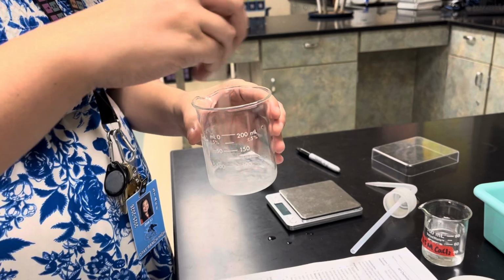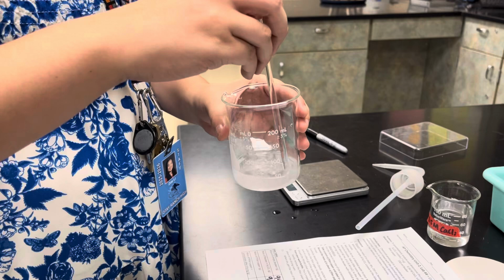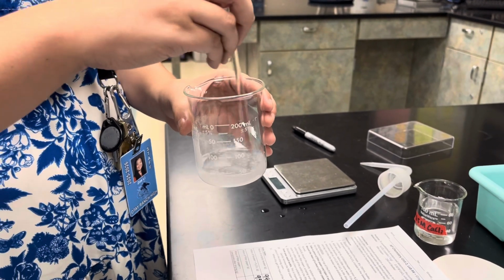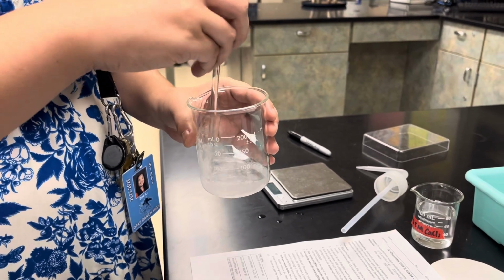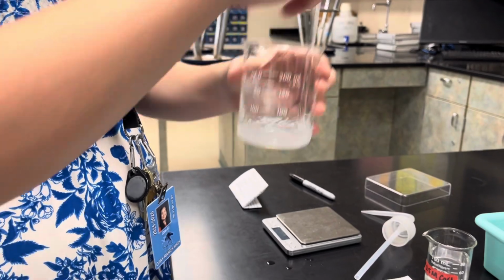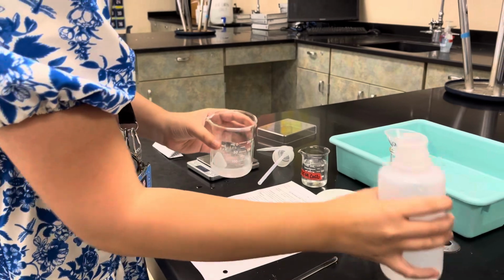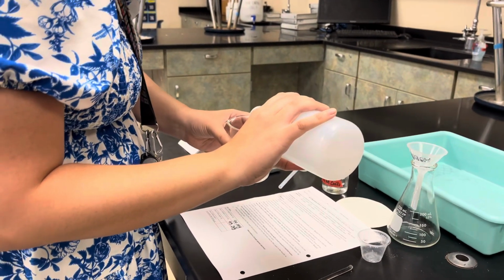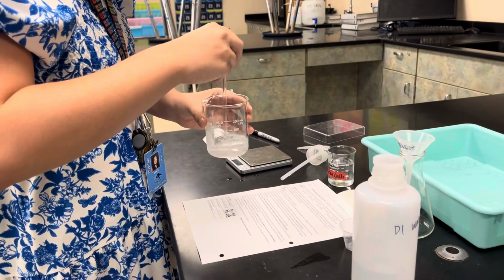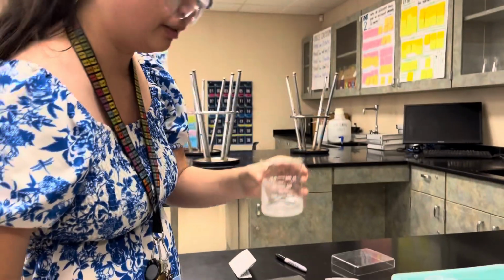So what we're doing is putting these crystals in solution because we need them to be in a solution in order to react with our other chemical. These are the mystery crystals. We're going to react them with something we know in order to get a precipitate. So we need this to be colorless before we move on. All right, so here's our crystals. Okay, let me add a little bit more water so it becomes a little bit clearer. And I'm going to keep stirring. All right, so that's pretty clear. So we can move on.